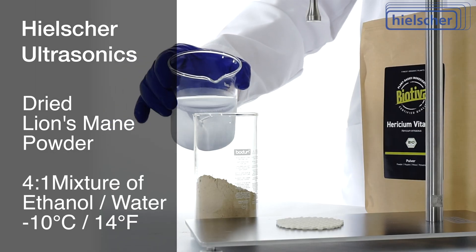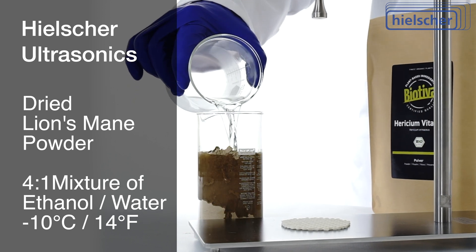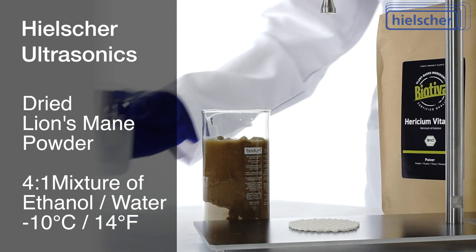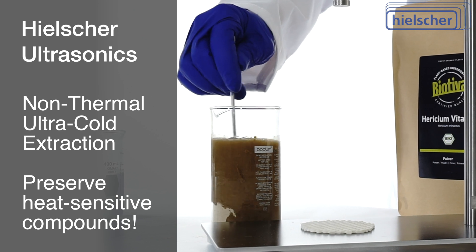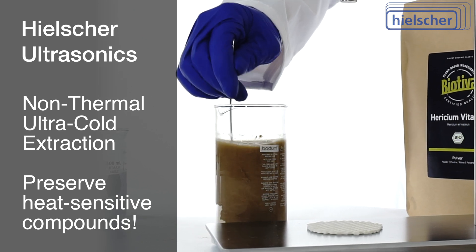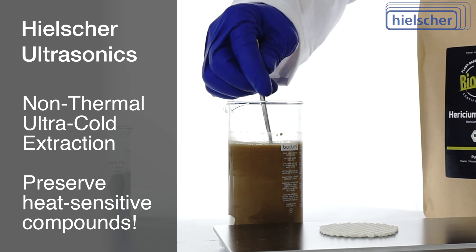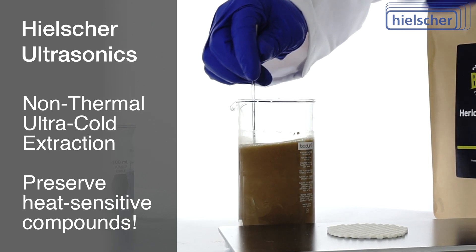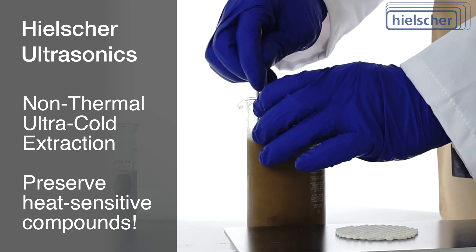We add a 4-to-1 mixture of cold water and pharmaceutical-grade ethanol so that we can extract at minus 10 degrees Celsius. This non-thermal, ultra-cold extraction preserves the maximum amount of heat-sensitive bioactive compounds such as beta-glucans and other polysaccharides, terpenoids like hericenones, sterols, glycoproteins, and many other health-promoting molecules.